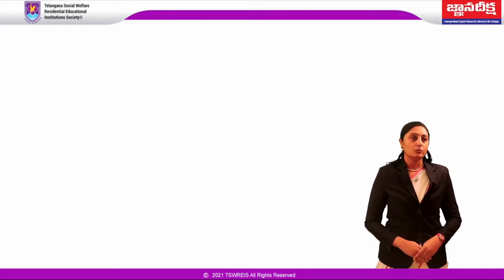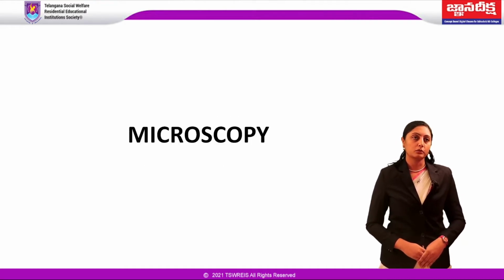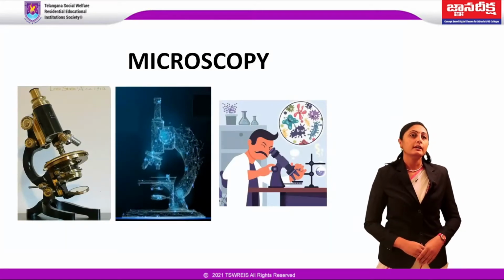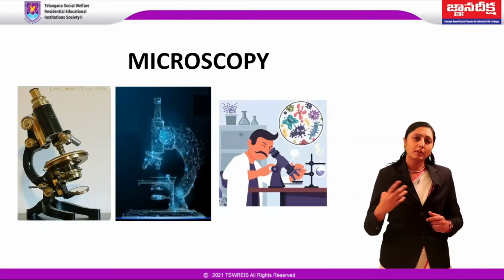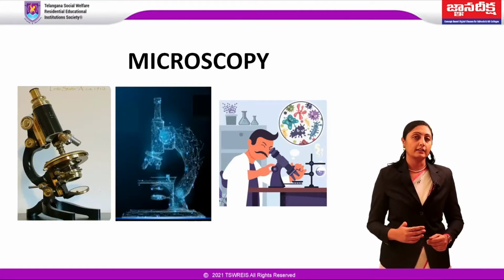In today's session, we will learn about an essential tool in microbiology, the microscope. The discovery of the microscope is a major milestone in the field of science and has enabled mankind to study the ever-fascinating world of microorganisms, called microbiology.